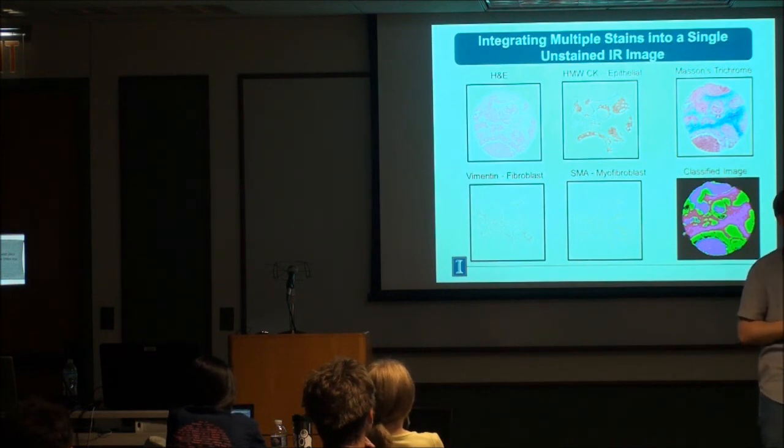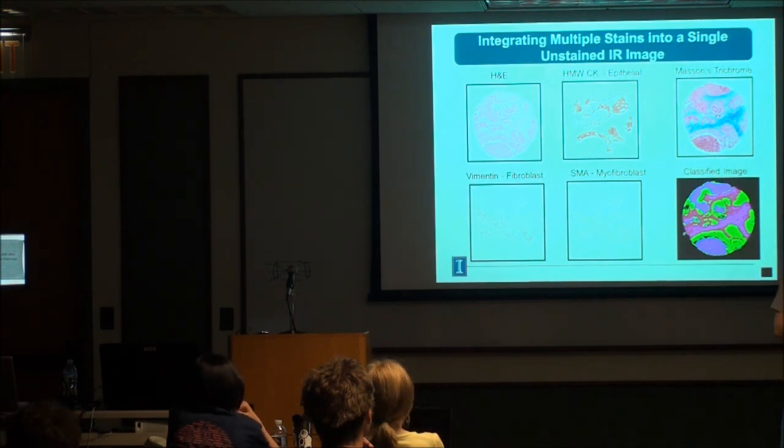Yes, we've done a lot of artificial neural network work. We've done some HCA work. I've done LDA work back in Lancaster. Yes, Bayesian tends to be very robust. The big benefit with Bayesian is over something like a PCA-based approach. Any type of data reduction which is not supervised, from the data compression aspect, tends to be problematic with spectroscopy.